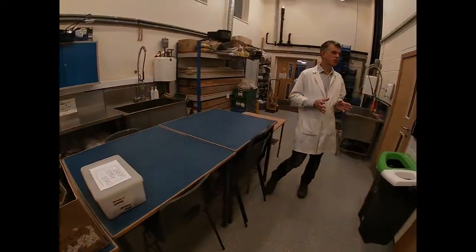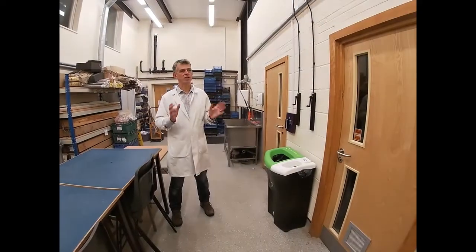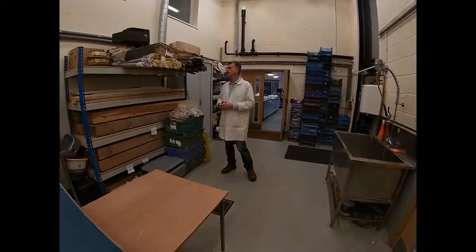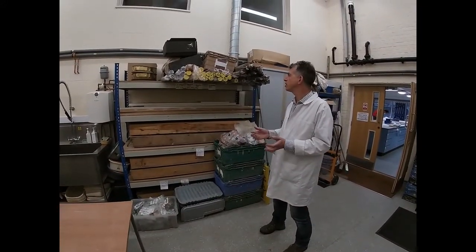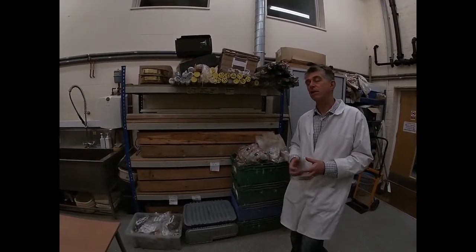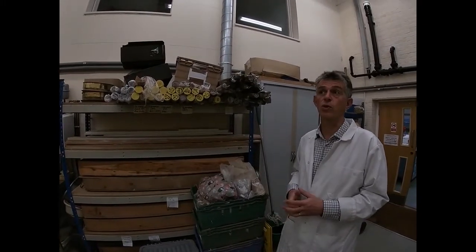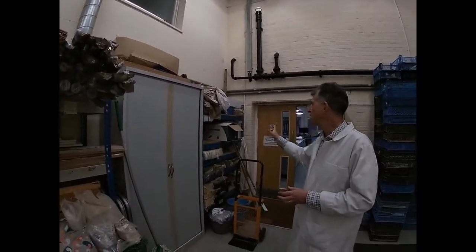We've also got a series of storage cabinets where we keep a lot of our field equipment. On my left-hand side here, we're not going to look at any of those during the course of today's session. Instead, we're going to move back and look at this storage area. We also have a departmental consultancy. It's called Geoarchaeology, and we carry out commercial work as part of the development process across the UK. These are just some of the cores that we've obtained during the course of those projects, which we are in the course of analysing. And again, we've got further samples that we're going to examine over here.